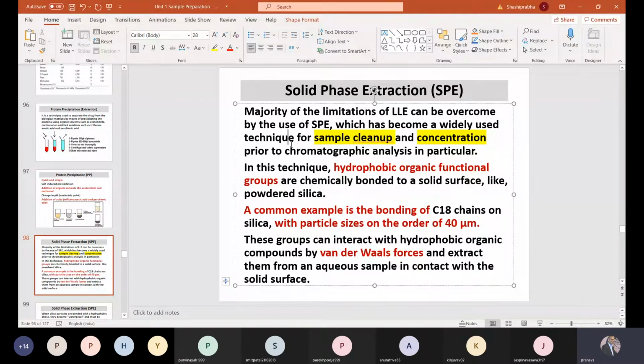Silica, as we know, is one of the most widely available materials, and it is relatively inexpensive. But unfortunately, it is highly ionic. It is also not very stable, and it can readily give up its H from OH and become a charged species.